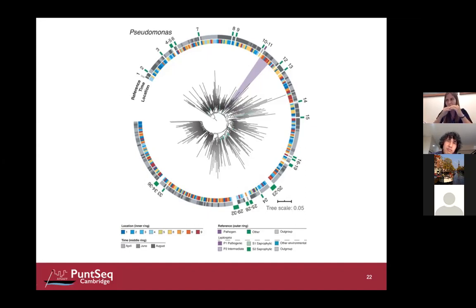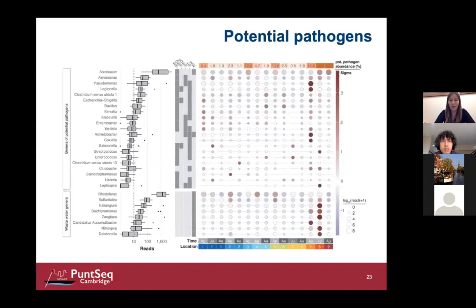Instead of just doing across-the-board species assignments, which might be incorrect due to the still quite high error rate of nanopore sequencing, we look down in detail into our reads and see what they suggest, even on a sort of biological, evolutionary level. So now if we go back again to the same plot, I want to point you towards one thing that, when I saw it, I was really struck by.